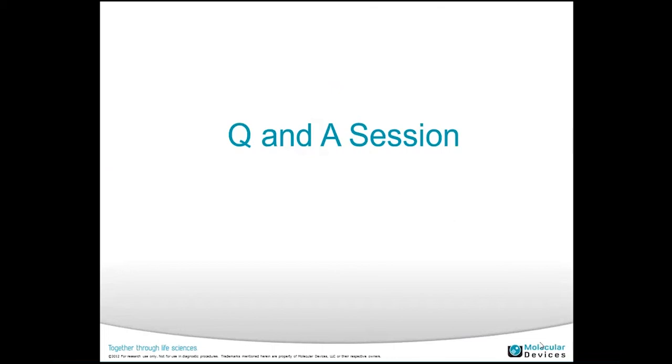So, Jeffrey? Hello? Hey, sorry. Let's go to the Q&A section. Sorry, I just had to unmute myself. Okay, so I have a couple of questions. One is for pCLAMP, and one is for Metamorph.